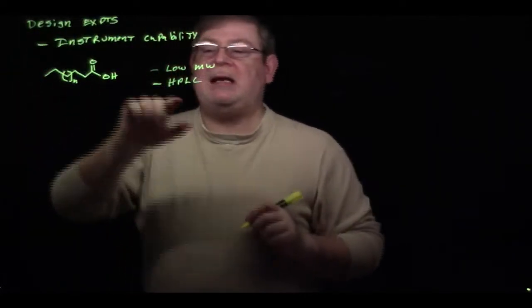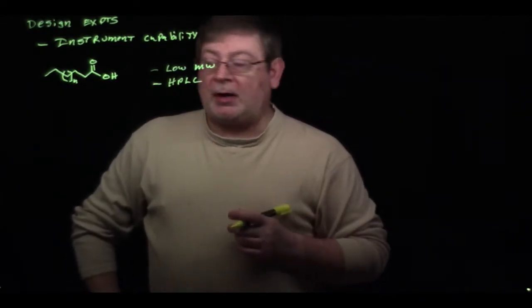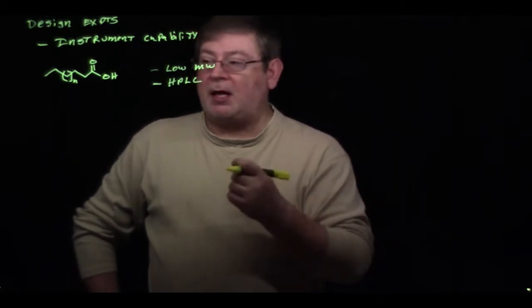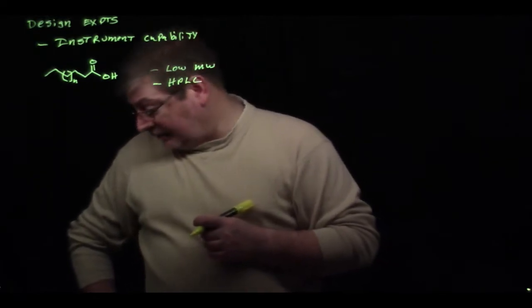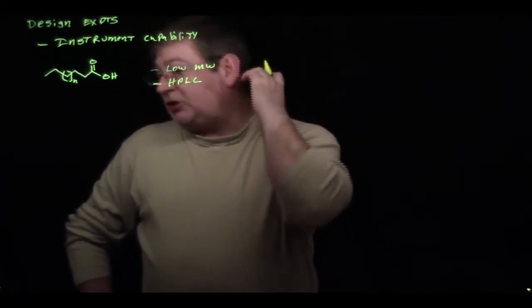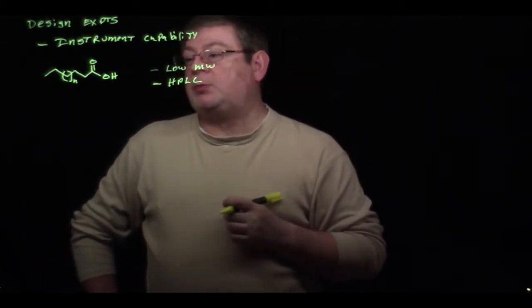So again, indicating that this might be the best way to do this is through electrospray ionization using the LXQ instrument that we have, because we can couple it directly to an HPLC system, right? So all of this seems to suggest that we might want to use our LXQ system or our electrospray.